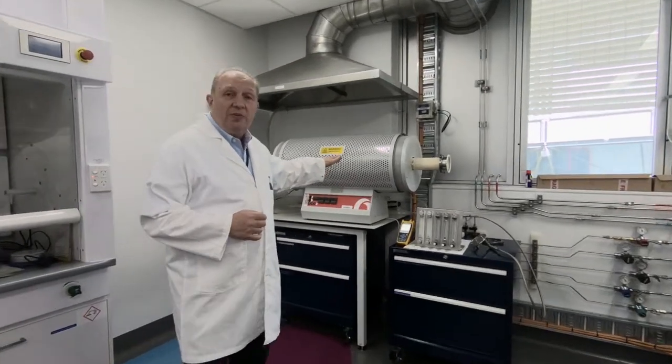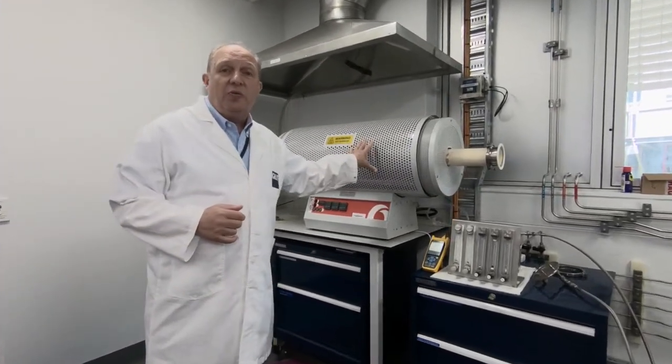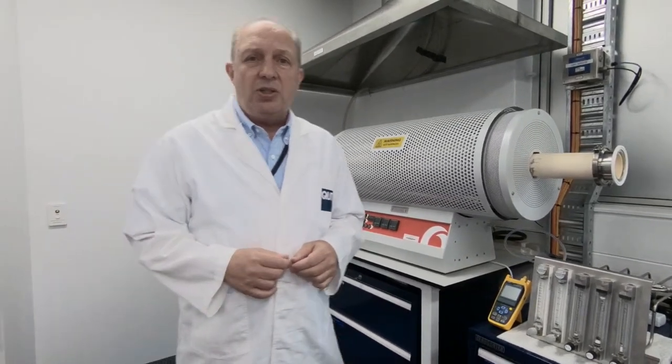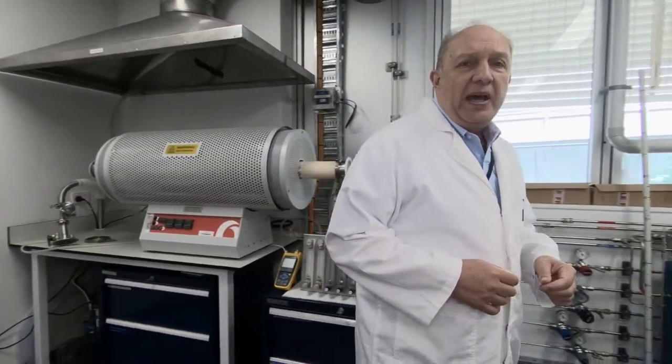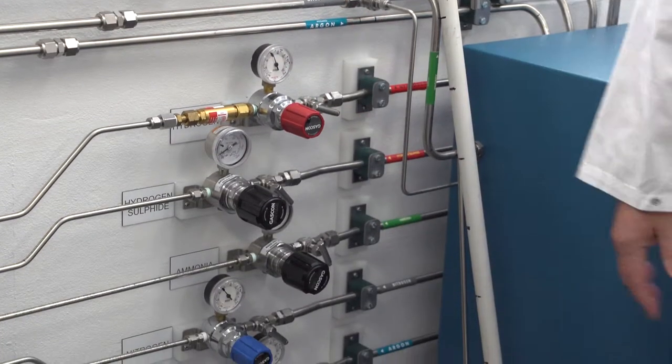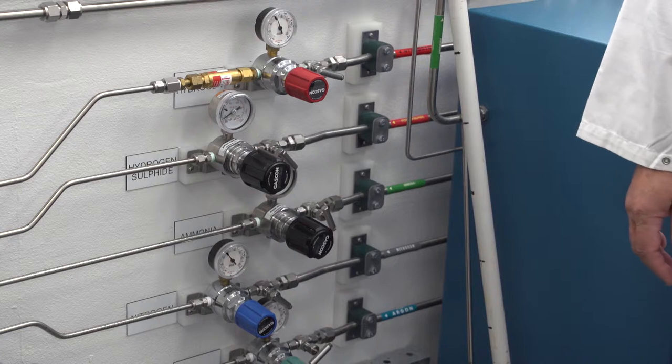We have a main component of this system as an electrical furnace, which can be heated up to 1700 centigrade. In addition to the furnace, we have pipelines for different gases depending on the chemistry of material we are going to prepare.